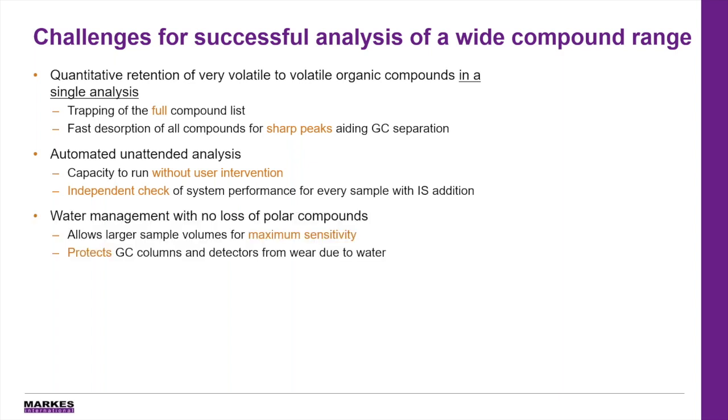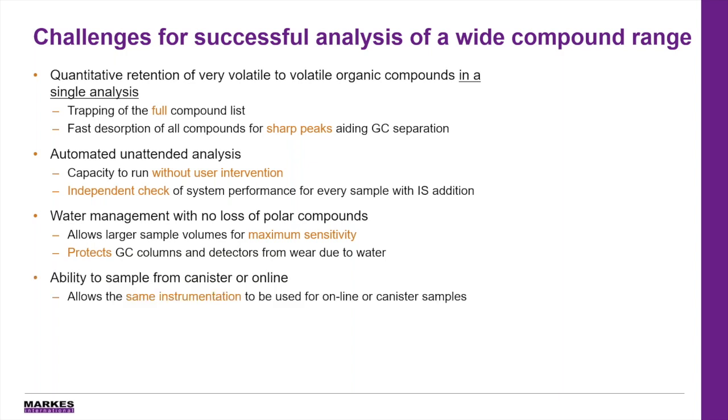Now, as we've seen, if we're going to look at polar compounds, we need a water management technique that doesn't remove them. And water management is important because large sample volumes will give us maximum sensitivity for this analysis, as with TO15A. As well, it protects the GC column and detector from wear due to water.